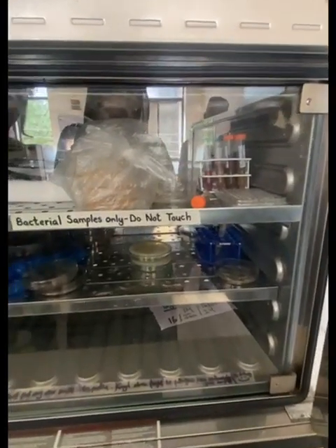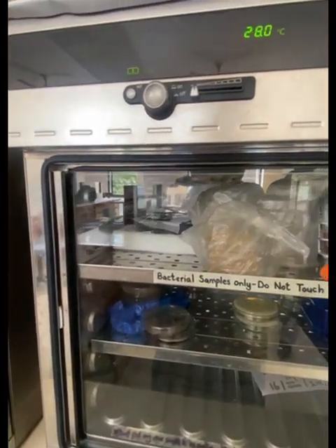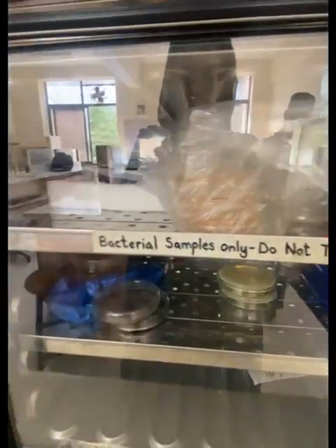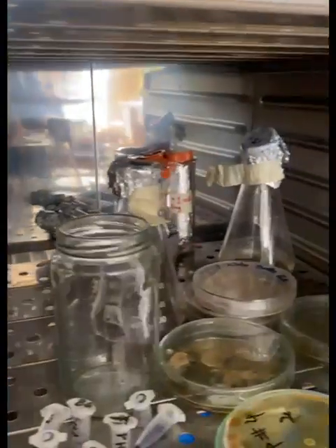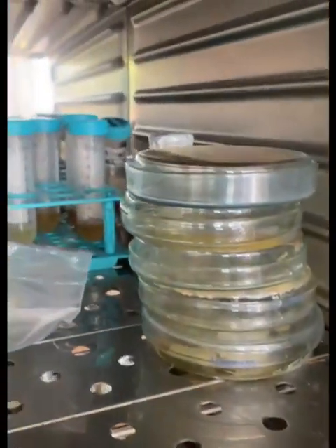Placing petri dishes in a growth incubator ensures that the cultures receive the necessary conditions for robust growth, enabling researchers to conduct experiments, perform tests, and observe microbial behavior under controlled conditions.